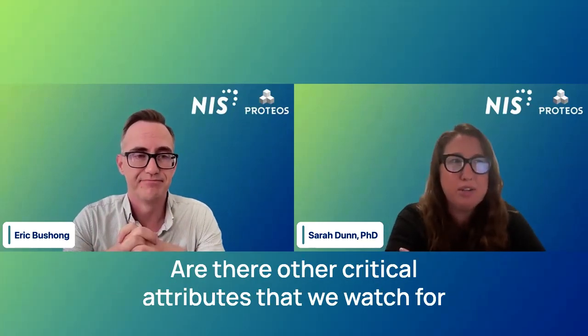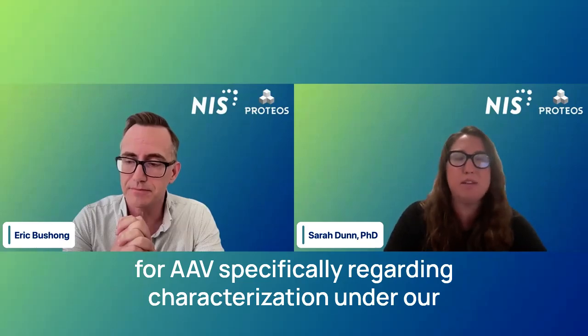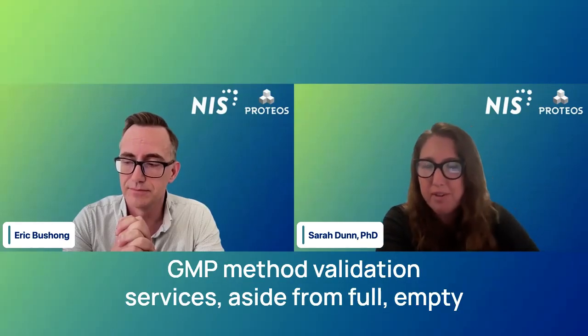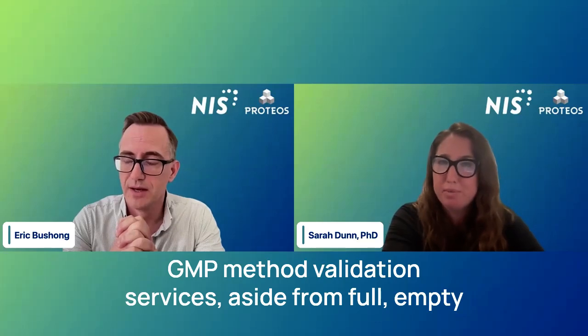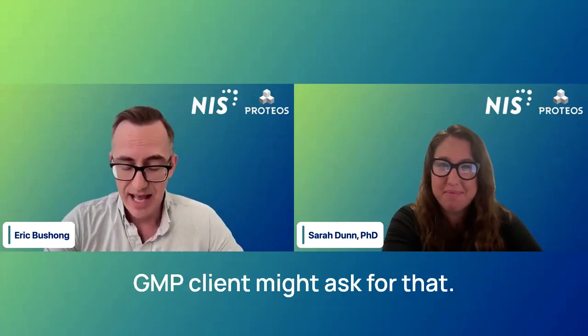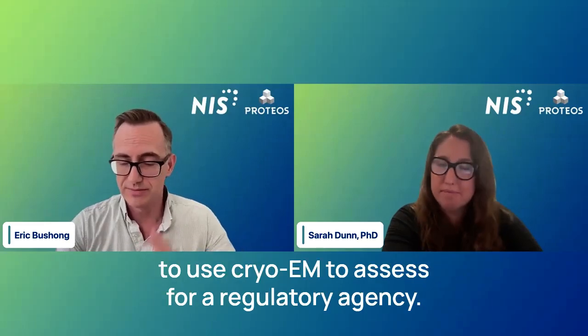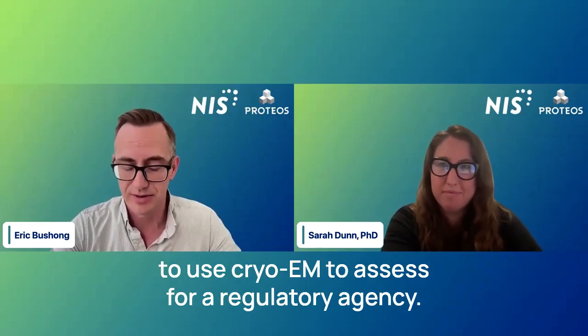Are there other critical attributes that we watch for in AAV, specifically regarding characterization under our GMP method validation services, aside from full/empty? For sure, again, we haven't done GMP yet, so I'm not sure what a GMP client might consider a critical quality attribute that they want to assess with Cryo-EM for a regulatory agency.